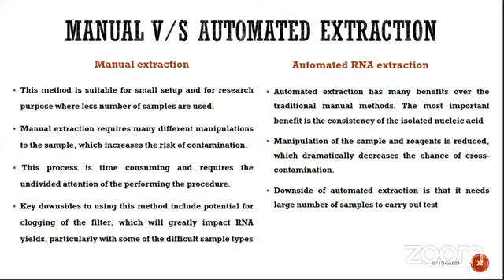If we are talking about automated extraction, it has many benefits. No, this is not the benefit. If we are talking about cost effectiveness, then manual extraction is recommended. And if we are talking about time management and quality, I think automated extraction has more benefit over the traditional method. And the most important benefit is consistency.